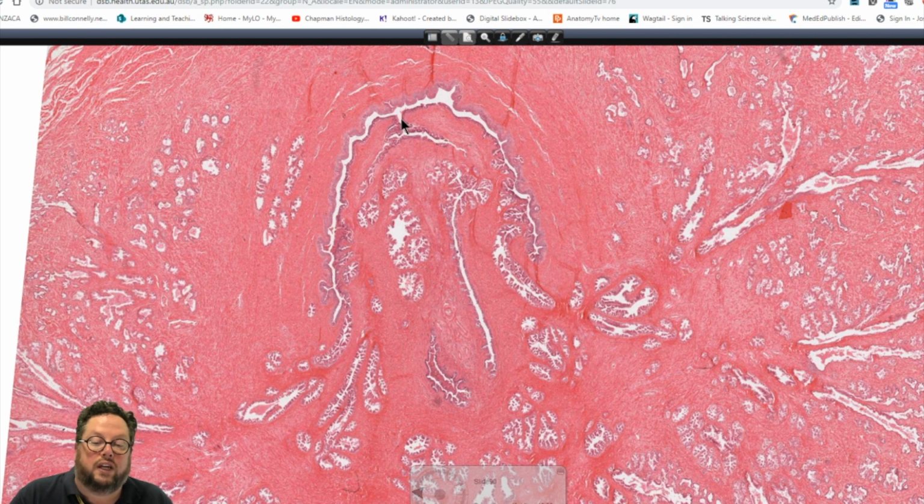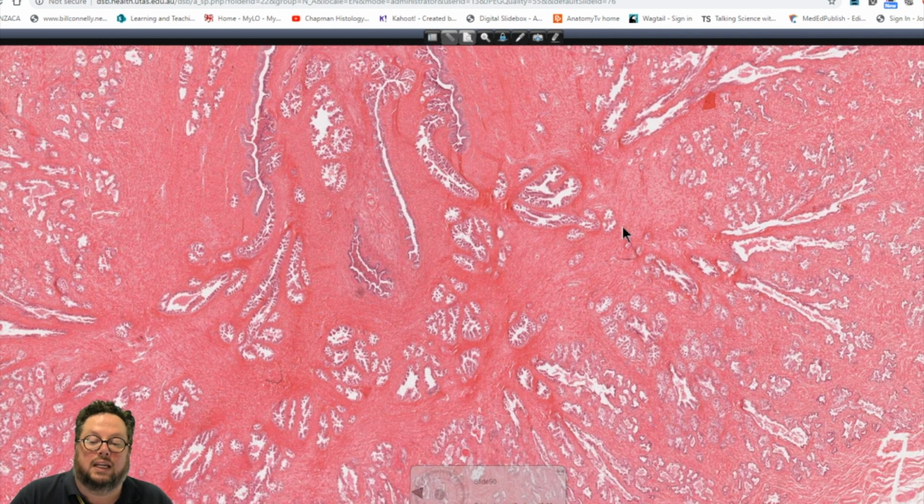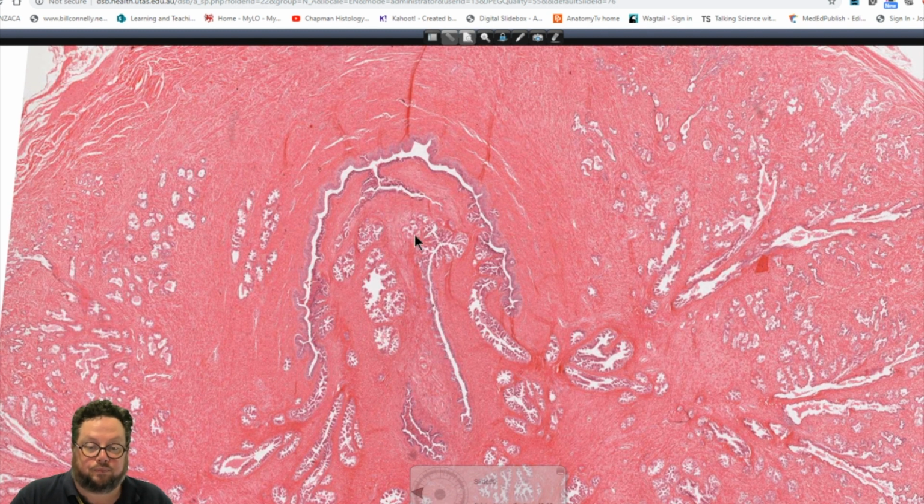And so the urethral crest receives the secretions from both of the mucosal glands, which empty directly into the urethral crest, whereas the urethral sinuses receive the secretions from the submucosal glands and the main prostatic glands, and they empty into these urethral sinuses here. So that's a little bit of a prelude to our look at the reproductive tract of people identified as male.